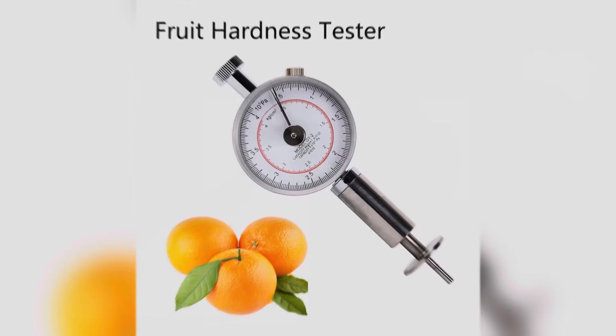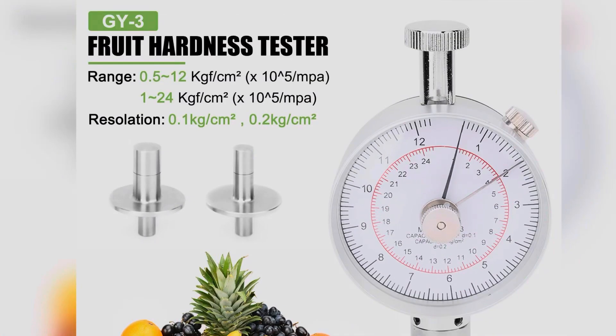Hello everyone, this is a demo video of the GY3 fruit hardness tester. It can test fruit hardness such as apple, pear, watermelon, banana, and so on. Let's check how the instrument works.